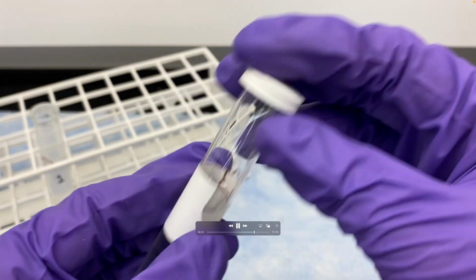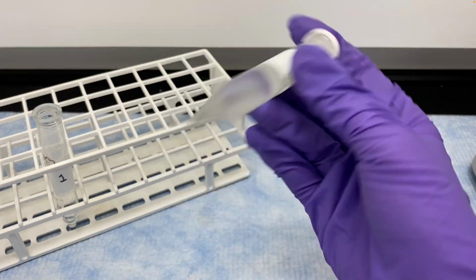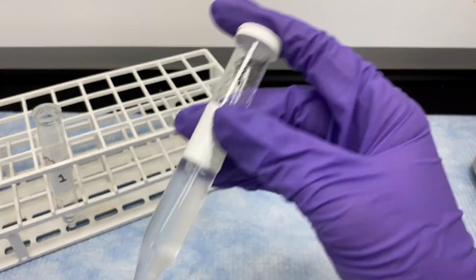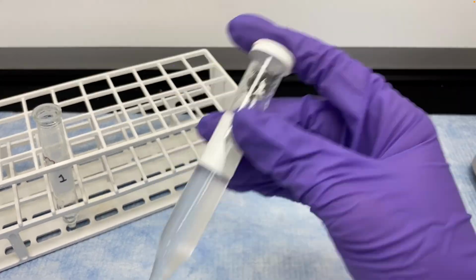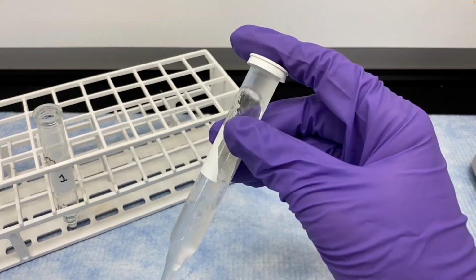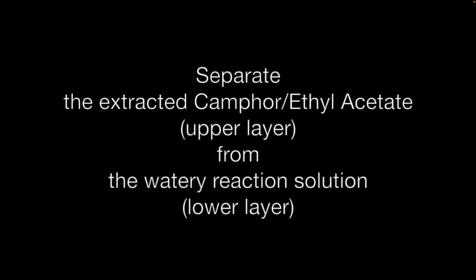Close it. Now we're going to shake it up. Any camphor that was in the water is going to move into the ethyl acetate. Don't forget to open the top of this every 30 seconds or so to make sure that the pressure that builds up inside doesn't make the container explode. So you're venting that. Okay, and now again, all the camphor that was in the water should be in the ethyl acetate, and we just have to separate them mechanically. We're going to do it the exact same way as before.